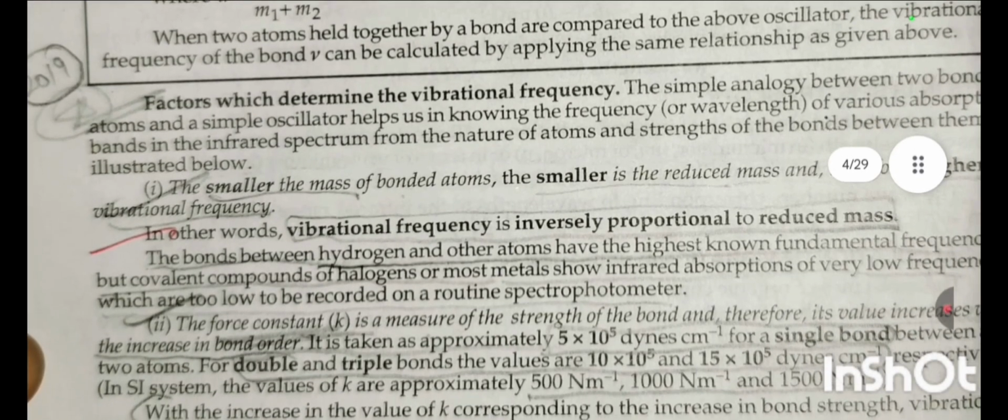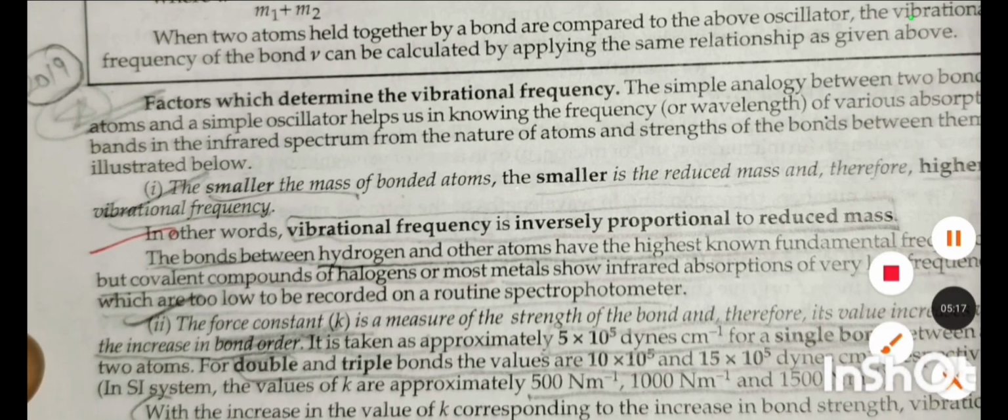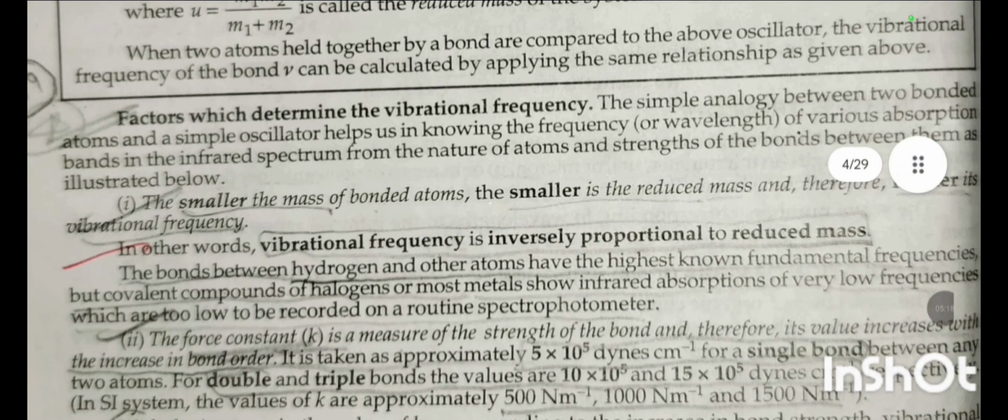Factors which determine the vibrational frequency. The simple analogy between two bonded atoms and a simple oscillator helps us in knowing the frequency of various absorption bands in the infrared spectrum from the nature of atoms and strength of bonds between them, as illustrated. The smaller the mass of the bonded atom, the smaller the reduced mass and therefore the higher its vibrational frequency. In other words, vibrational frequency is inversely proportional to reduced mass.